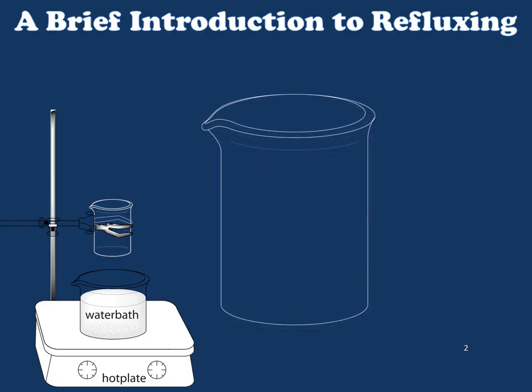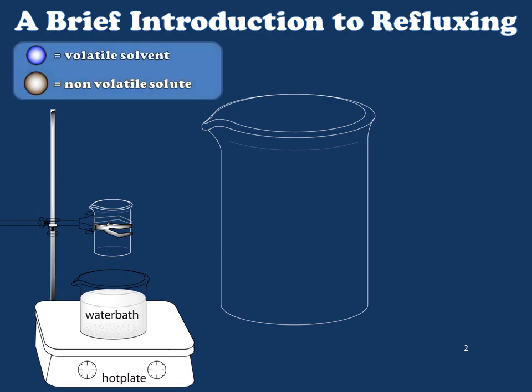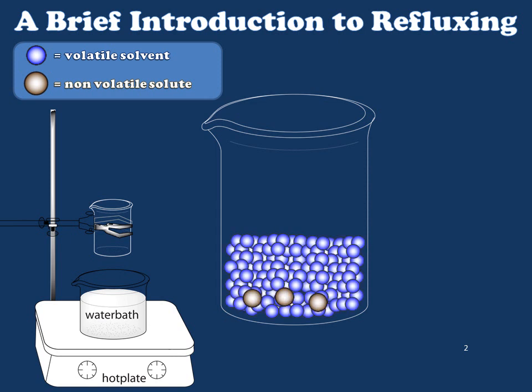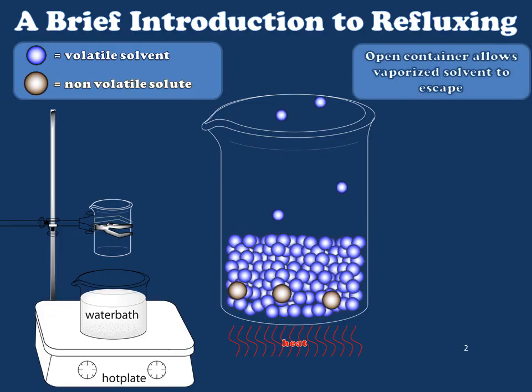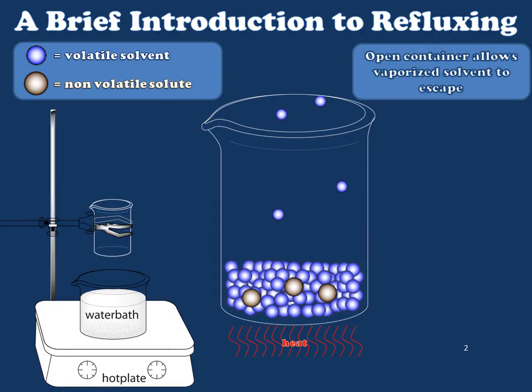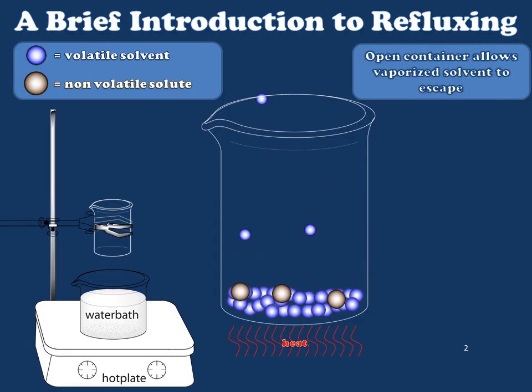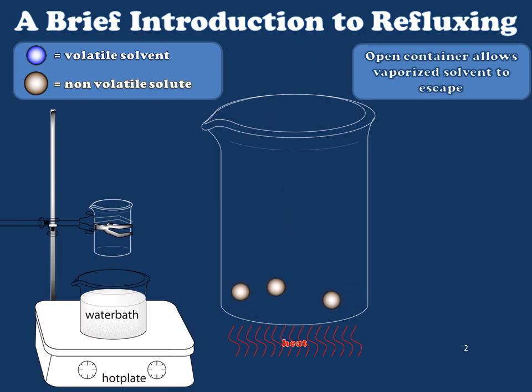Within our beaker, we're going to place two different kinds of molecules: those of volatile solvent, shown in blue, and those of a non-volatile solute, shown in brown. As we apply heat to this mixture, we expect the volatile solvent to boil. As you can see, the solvent vapor is escaping and not returning to the flask. This means that over time, we expect all of our solvent to become vapor and ultimately escape, leaving behind simply a residue of the non-volatile solute.